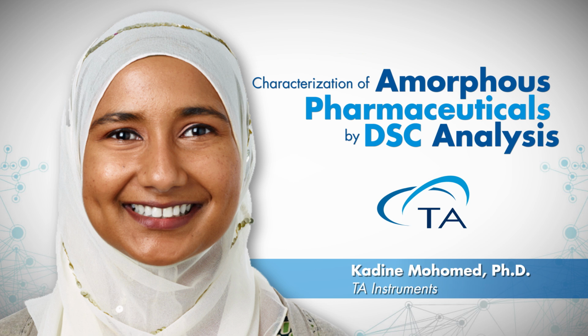Okay, great. Kind of associated with that, we have a question here that you've sort of answered, but I think maybe a little clarification would be good. The question is, can a modulated DSC equipment work like a DSC equipment, or is a DSC equipment always more sensitive than modulated DSC? First, you would need to have a DSC, a DSC with the capability to modulate the heating rate of that DSC cell or furnace. So modulated DSC is an option on a DSC.